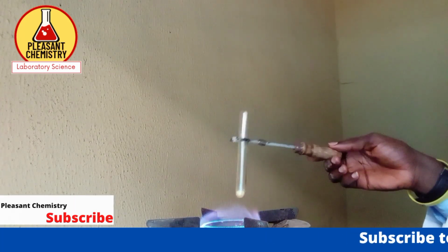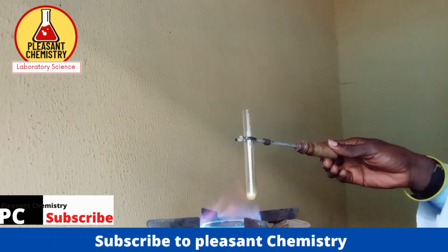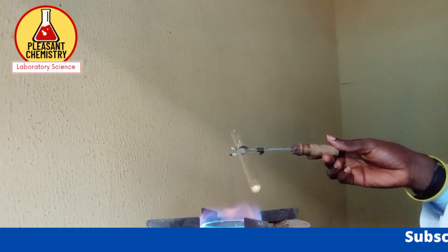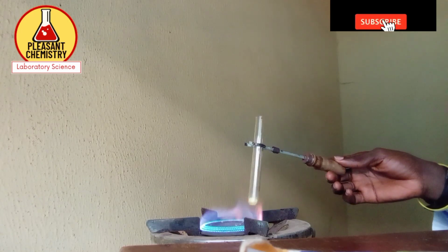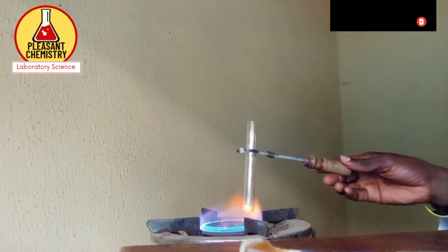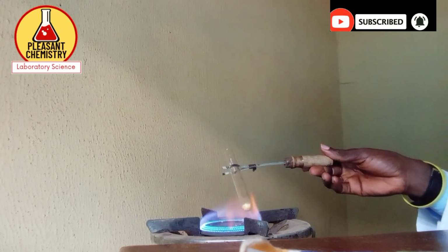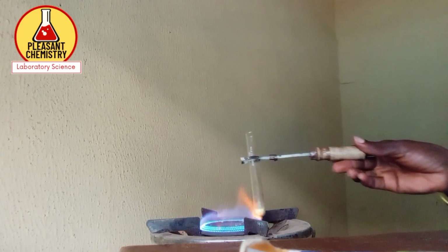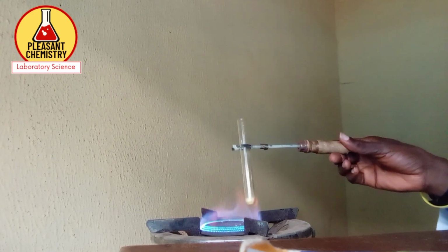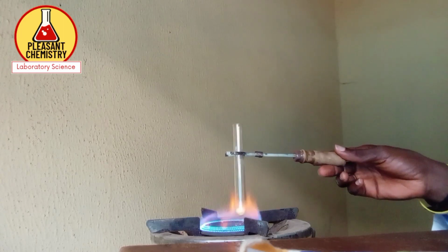While heating my sample D, there was an effervescence of a colorless gas, because the gas that is involved, I couldn't see the color. Definitely, since the gas doesn't have any color and is also odorless, if I had my lime water now, I would have tested the gas with lime water, but I know the gas will definitely turn lime water milky, and that is to say it's carbon dioxide. It's only carbon dioxide that has that property.